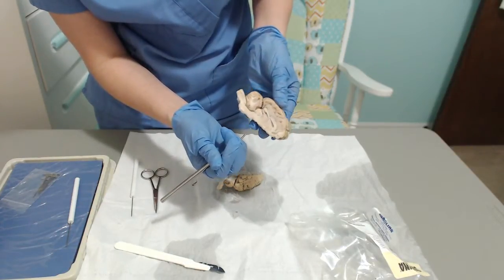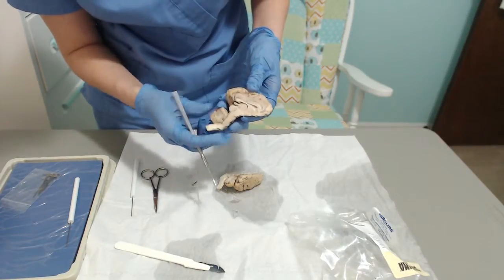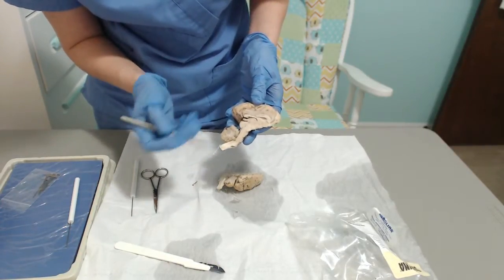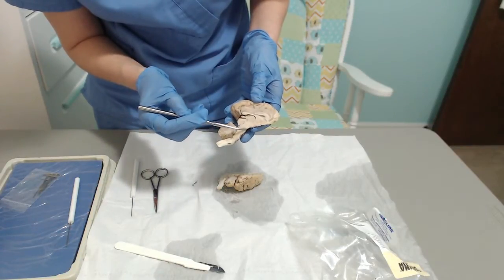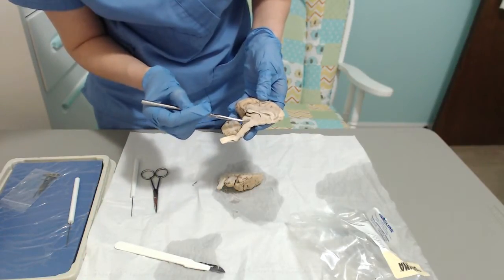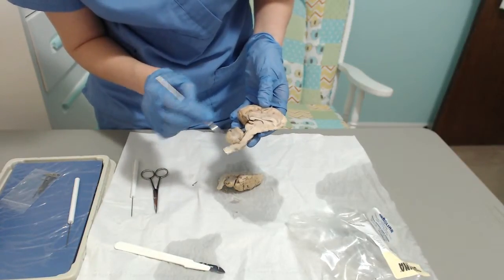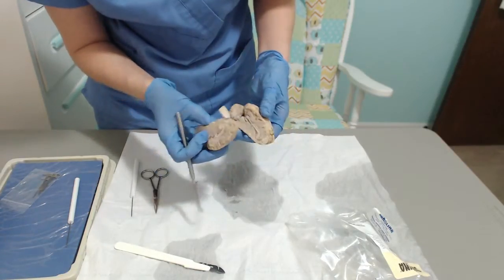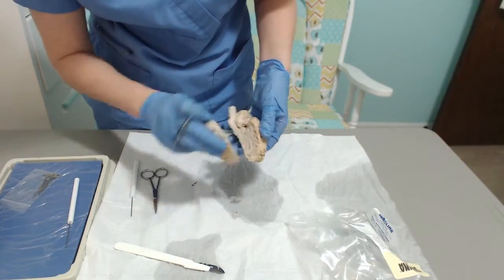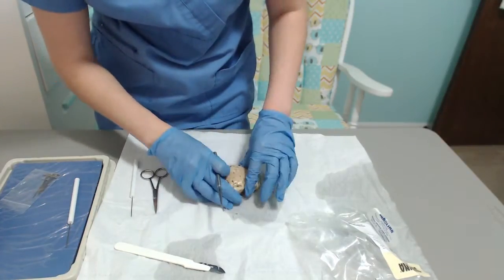And then of course we have the brainstem. Again, the position's a little bit different, but the brainstem consists of the midbrain section. Then you have the pons, which kind of bulges out a little bit, and then the medulla oblongata, which is the longer part that extends down. And that is all of our anatomy terminology for the sheep brain.